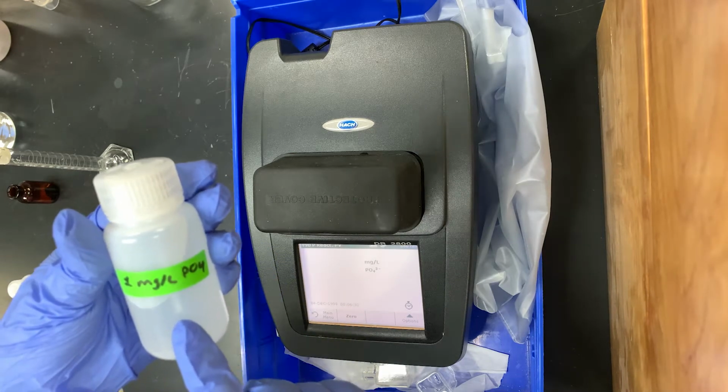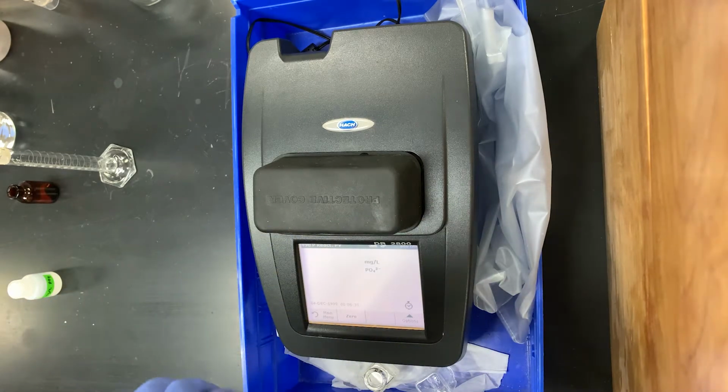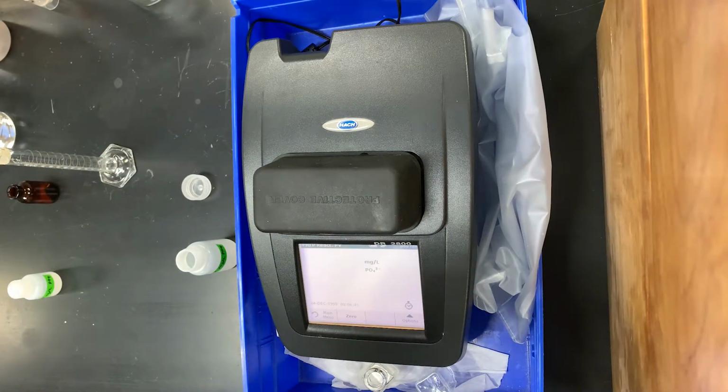So we'll just hit start on here, and as you can see, our units are already in milligrams per liter as phosphate, which is good because that is the units that we want. So this technique uses 20 mils of our sample. So we'll put 10 mils into one cuvette and 10 mils into the other using the 5 mil Eppendorf pipette.